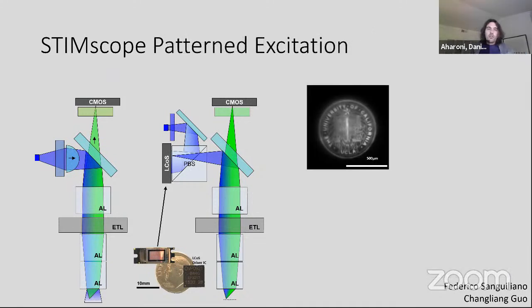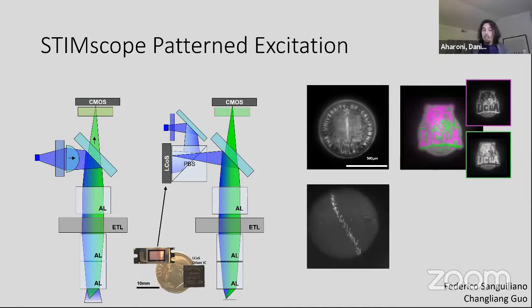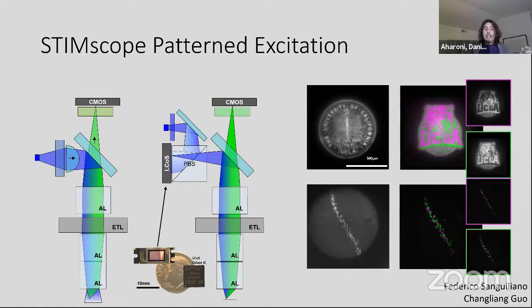So I'll skip over all this, but it has a bunch of potential here. We can, in an automated way, identify cells and select which cells we want to illuminate. And you can do this with 2 colors at once. So you can imagine imaging a population of neurons while actively actuating specific neurons at close to single cell resolution in a closed loop manner while you're imaging neural activity and behavior with optogenetics.